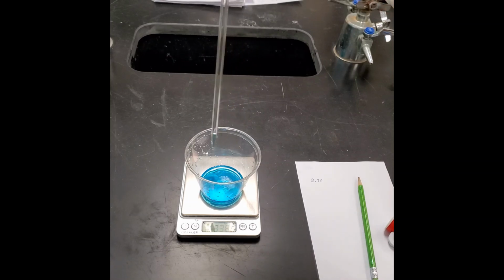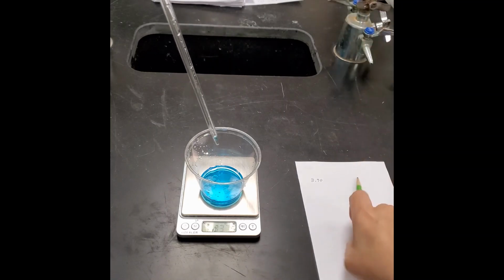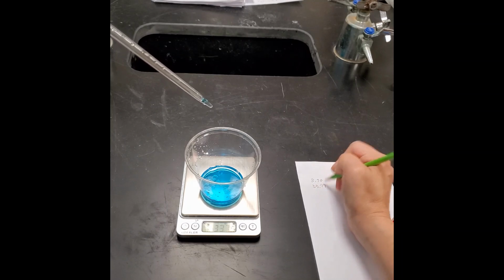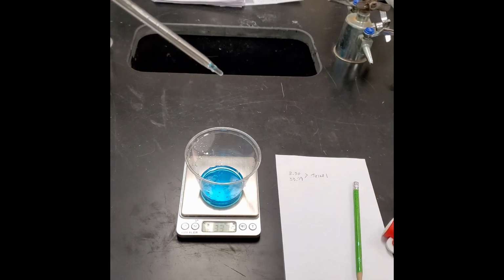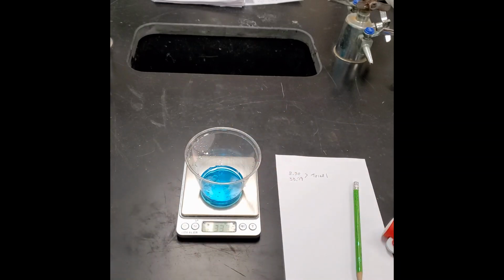Now, one thing I want to note: after it gravity drains, you see that there's a little bit of liquid in that tip? Leave it there, okay? The reason is this is designed to deliver that volume with that little bit in the tip. All right, then I record my mass. It's going to be 33.79, and I write it down. The difference of these two is trial 1. I'm going to do this 3 times, or 2 more times total.